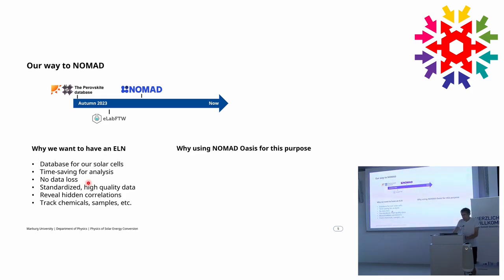The reasons for the decision are, for example, that the data in NOMAD and NOMAD Oasis is really more FAIR than, for example, in eLabFTW, because we have lots of metadata behind our data.